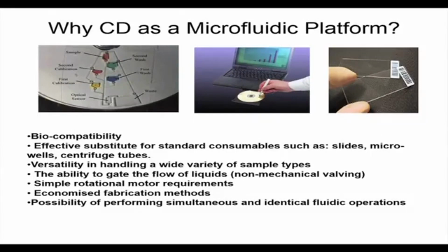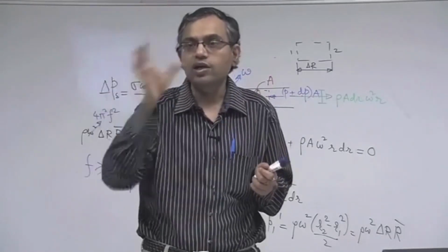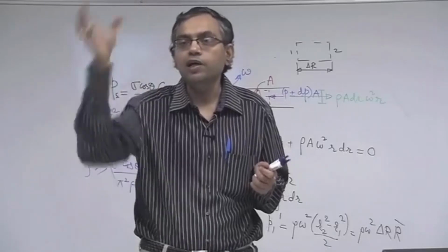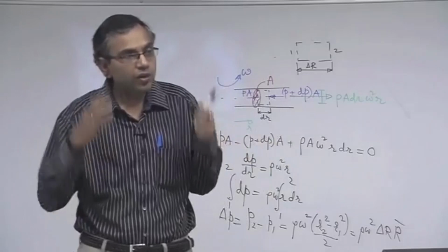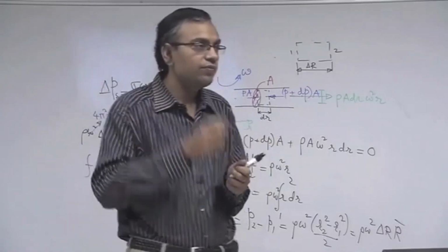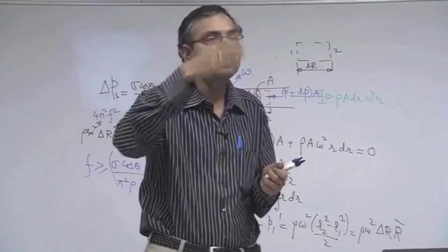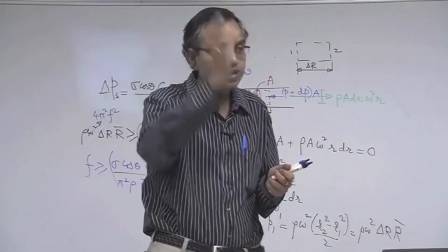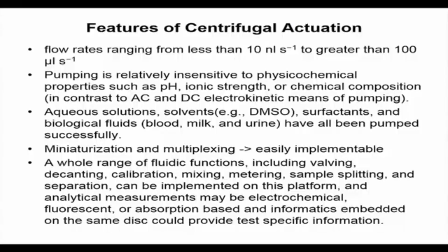So technically, by using one drop of blood simultaneously with a single rotation of the disc, you can make 100 pathological tests. That is a very unique advantage. For making the fluid flow through different channels you do not have to use different actuation; a single actuation will be able to transmit flow in all channels.